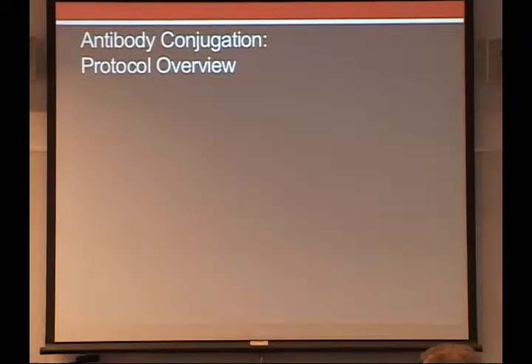Is sodium azide a problem? No. During the conjugation itself? Most antibodies come with sodium azide, so when you're doing typical labeling, which is amine-based, it can be an issue, but it doesn't appear to be a problem here. It's not a problem during the labeling process, and we actually store our antibodies in azide to prevent microbial growth and that sort of thing at the end of the day also.